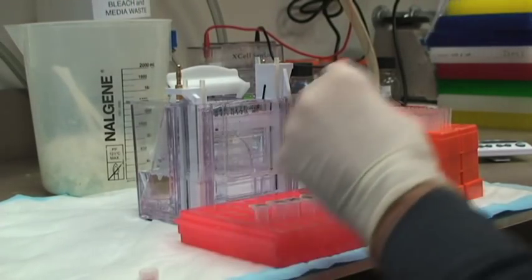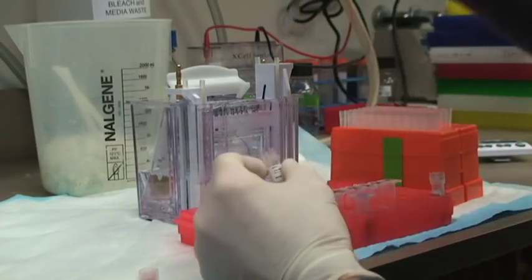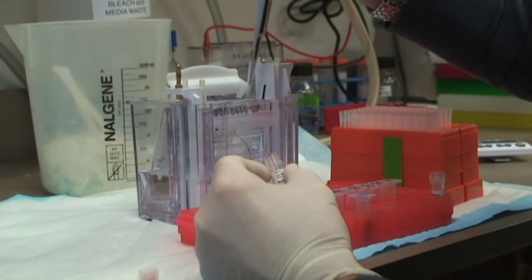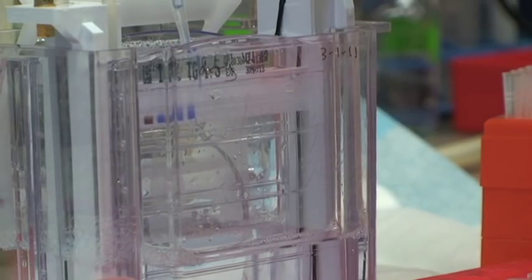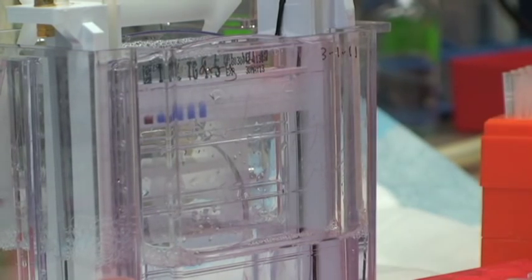When would you use a native gel, a non-denaturing gel? You can see protein interactions sometimes. Also, you could, in theory, see conformational changes. But most Western blots are done with denaturing SDS gels.